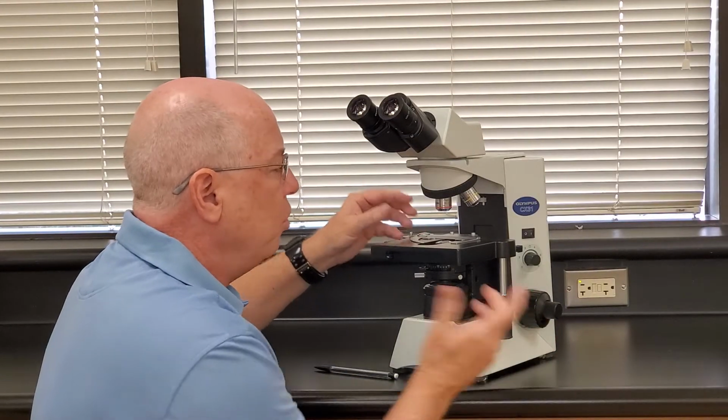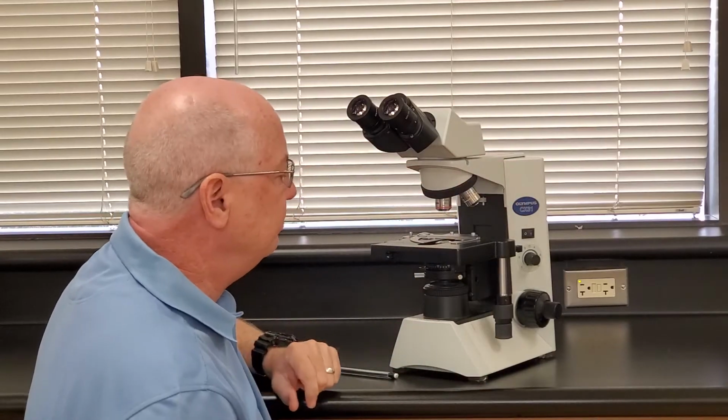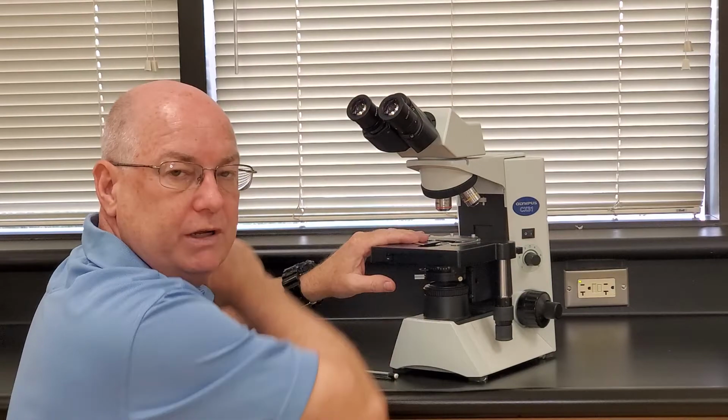So now, when you are asked to mount a slide, you have to have the red objective, the low magnification objective in place, and your stage should be all the way down. You should have maximum working space here.